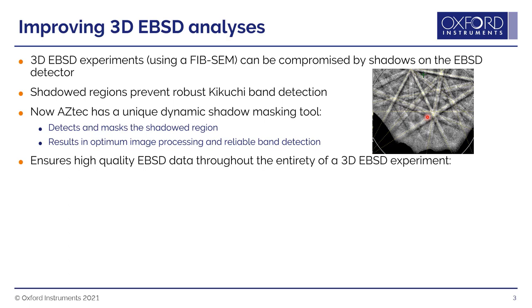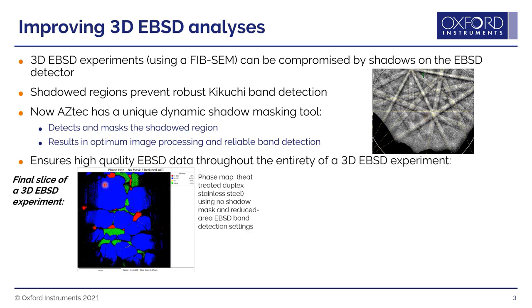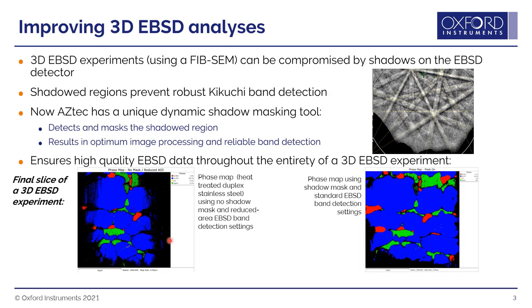As an example, this is taken from the final slice of a 3D EBSD experiment — a phase map of a heat treated duplex stainless steel with intermetallics. Collected without the shadow mask, we reduced the area used for band detection but still lose information at the sides of the phase map. Switching on the shadow mask and using normal band detection settings, we can see much better quality data on the right hand side. This will improve the quality of any 3D EBSD experiment and will also benefit analyses of other rough samples, such as fracture surfaces or faceted crystals.